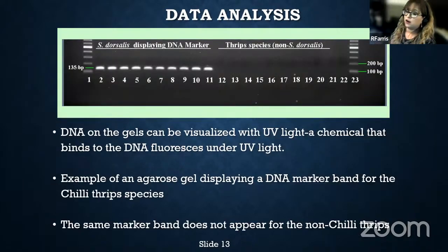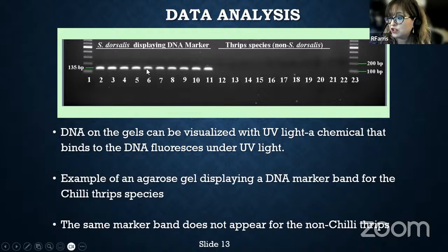So you can see right there, this is a gel showing some PCR products. You can see the PCR products right here, and they're fluorescing. This gel image was taken under UV light. What I want to show you here is an example, this gel, of a chili thrips DNA marker that I designed several years back. It's a conventional PCR-based system, very straightforward. So basically, if you get a PCR product for your DNA, that means it's positive for chili thrips.